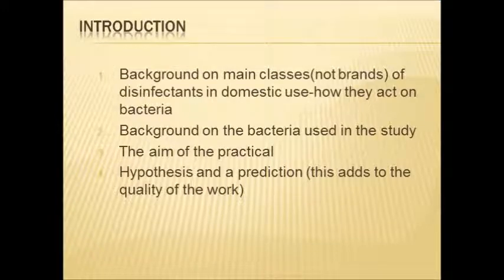So let's look at those different sections in a little bit more detail. First of all, the introduction. You need to set the scene with some background on disinfectants. Watch the Moodle video and make some notes on their active ingredients and how they kill bacteria. Do they act on the membrane? Do they act on protein synthesis? And so on. Then look at your 3 bacterial species. You're familiar with them by now, and explain the aims of your investigation.